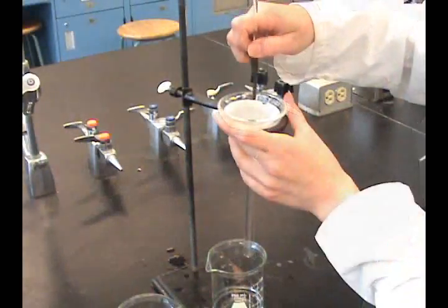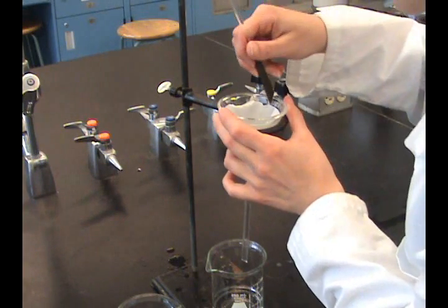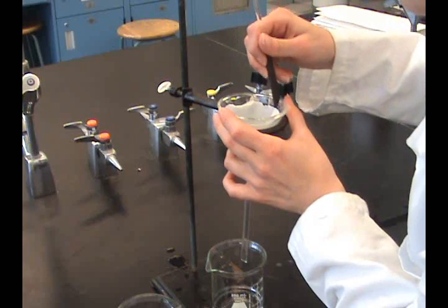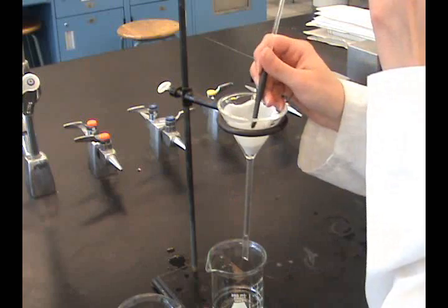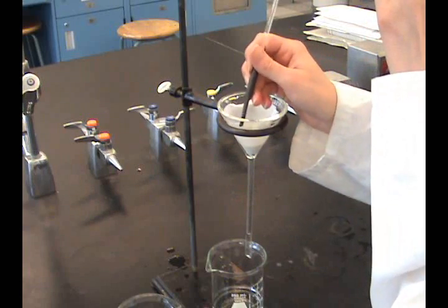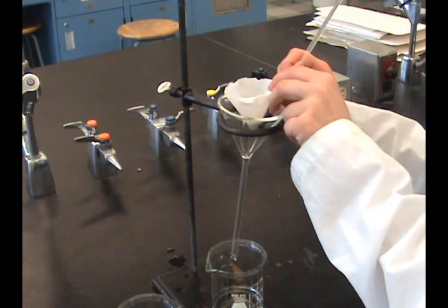Use a policeman to release the filter paper from the funnel carefully as not to rip or tear the filter paper. If igniting, fold the upper edges and place the filter with the filtrand in a crucible that has been brought to constant mass.